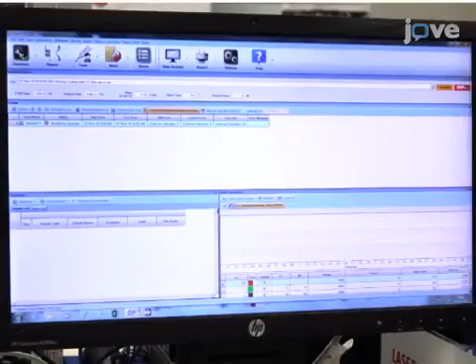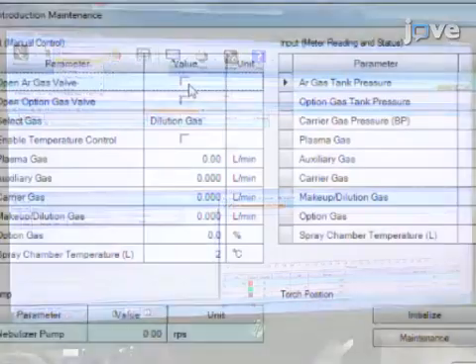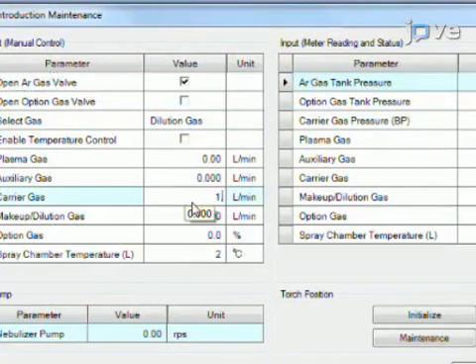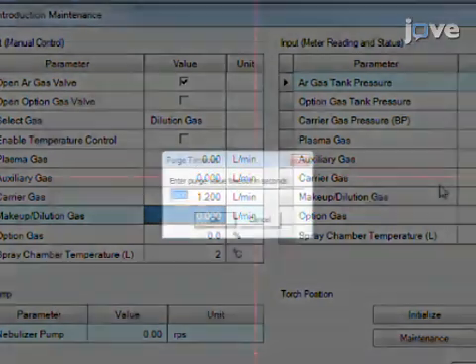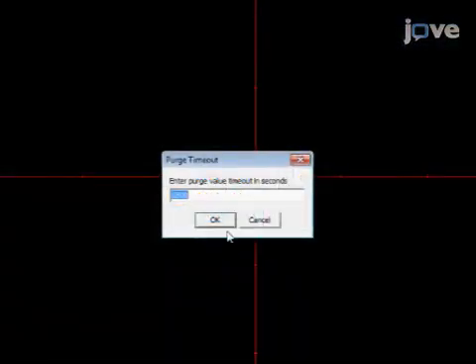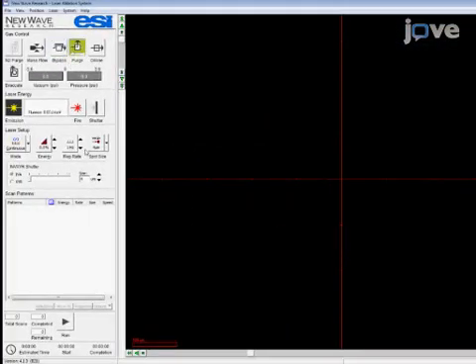Then, in the ICP-MS software, open the carrier gas valve and set the flow rate to 1.2 liters per minute. In the LA software, run a 30-minute purge of the ablation cell with the carrier gas.